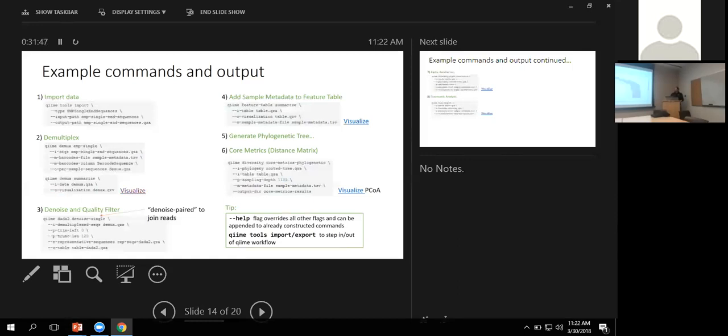If you need more resolution, you can just drag and zoom in. You can mouse over these different base positions to get summary statistical data for each position as needed. And then if you need to zoom out, you just double click here. It's kind of difficult without a mouse. Okay. So that's our demultiplex data.